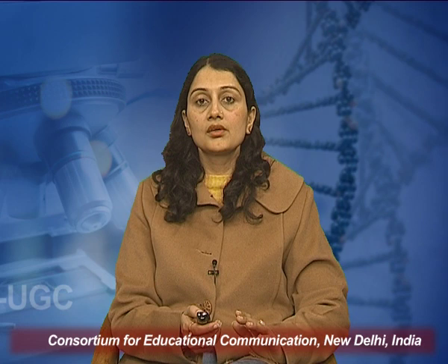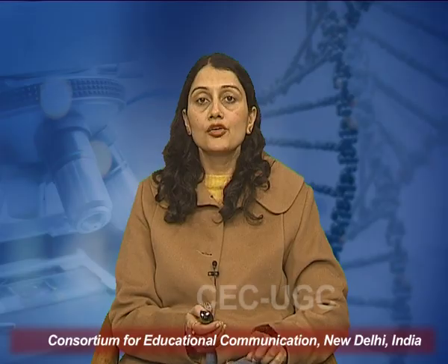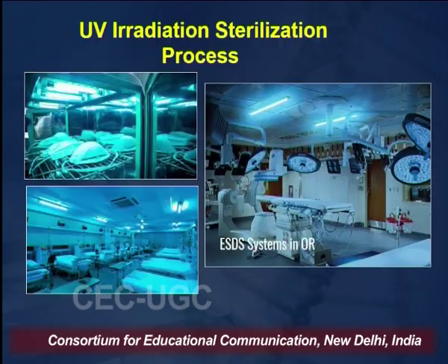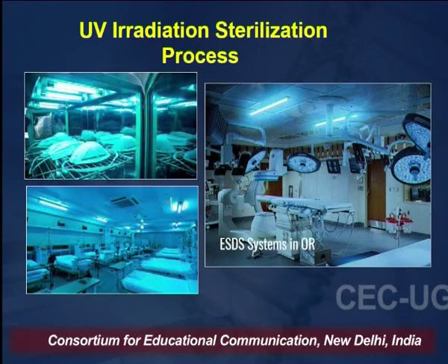And once you disinfect your hands, you wear the gloves and again you wipe your gloved hands with 70% ethanol to avoid any kind of microbial contamination. So, this is your sterilization. This is how you take it in a large quantity so that it can cover the entire surface area of your hands. Now, let us move to another physical method, which is the use of radiation.